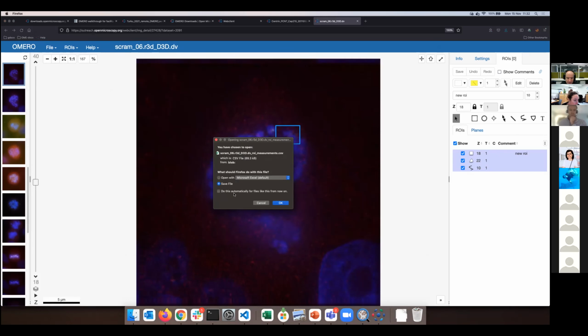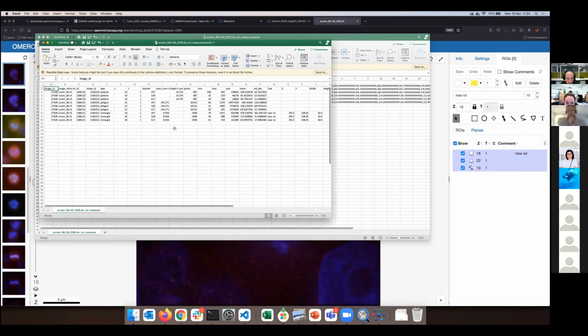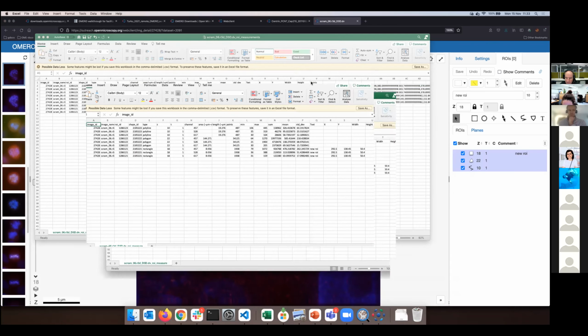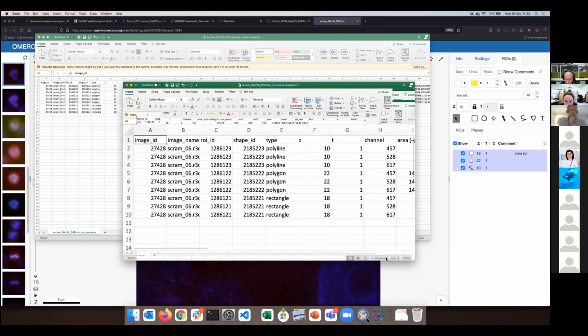After that, my Firefox is asking me whether I want to directly open with Excel or save the file. So let's say this time I will say open. This open nevertheless means actually download and open, okay? It's just a shorthand from my operating system here. It will download and open the file in Excel. So these are 2 steps in one breath. And this Excel file is already locally on my machine, okay? Was it clear enough? For the second?